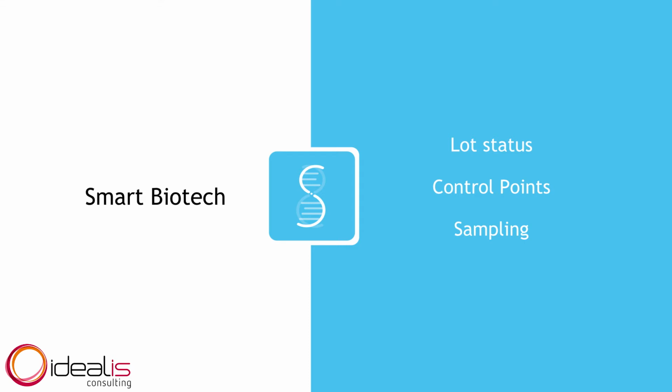In our Smart Biotech solution, you will be able to decouple quality flows from inventory management or manufacturing flows. Thanks to statuses on your lots, your ERP and your different departments will know if a lot of products has to undergo quality control. For example, you will be able to receive a lot of products that needs to do a quality check on entry into stock.